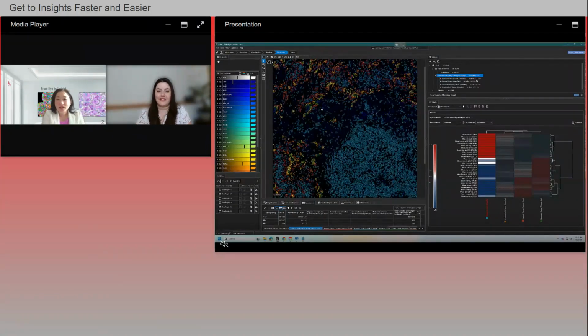And I think there's another interesting question there. Yeah, this next question that we have is asking, is the cell painting tool able to detect a variety of cell morphologies, such as elongated cells in addition to circular cells in the same tissue section?